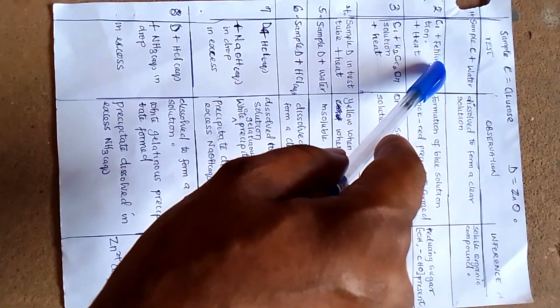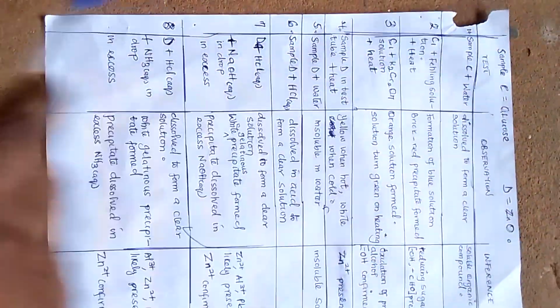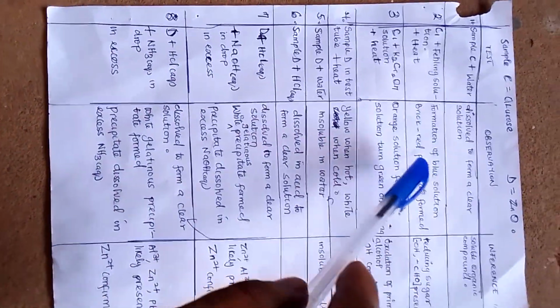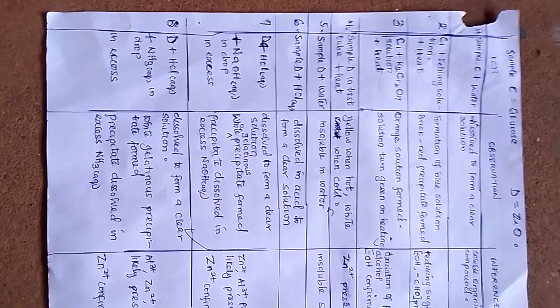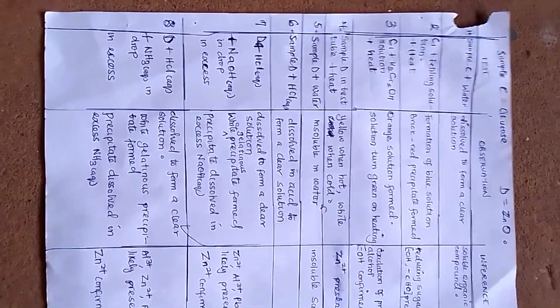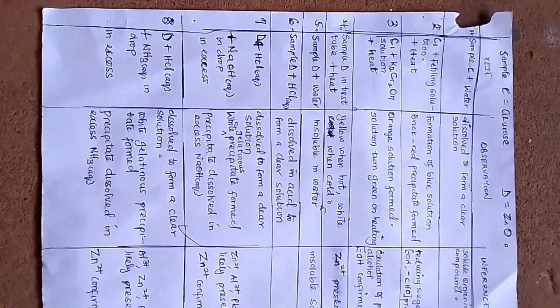So add Fehling's solution and heat. Actually, for Fehling's solution we have A and B. Your teacher will have mixed the two together to give you a light blue solution. That's Fehling's solution.